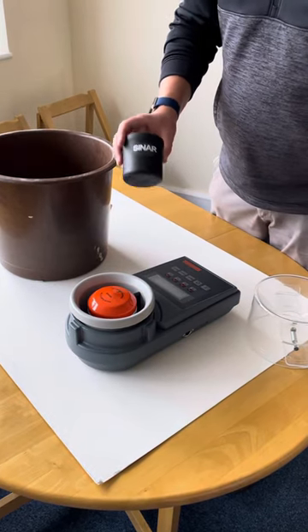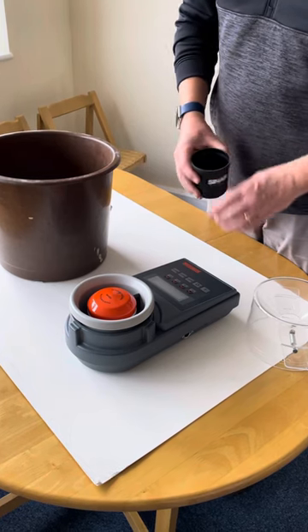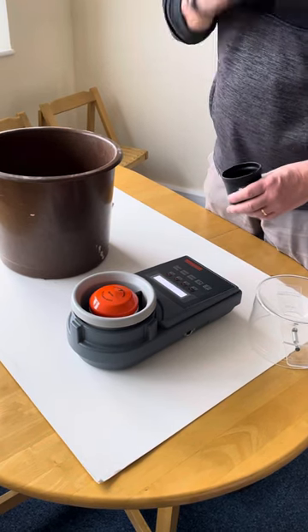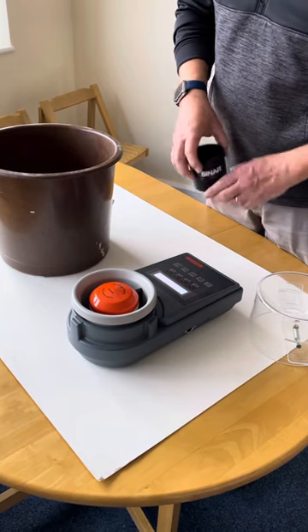So what you're going to need is a fixed volume density cup and a 6070 moisture meter, and hopefully some green coffee beans. We turn the unit on and make sure that it's reading green coffee — this one already is.